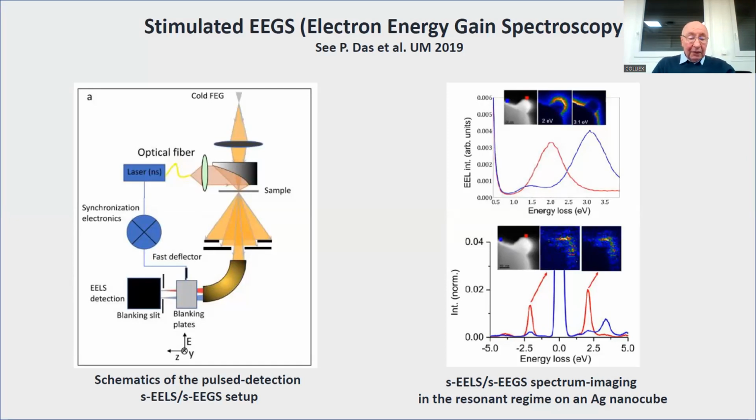Pardon. But we have developed the technique of blanking plates on the detection. So the detection gives you the time scale to measure. These are, for instance, on a specimen of nanoparticle of silver there, I suspect. This is without the illumination by this laser. And there you have two peaks depending on two positions of the spectra.